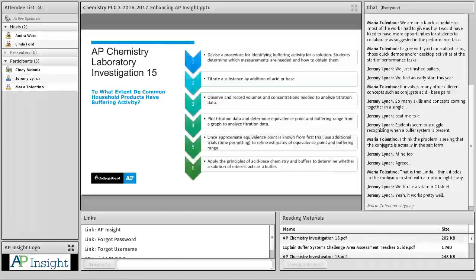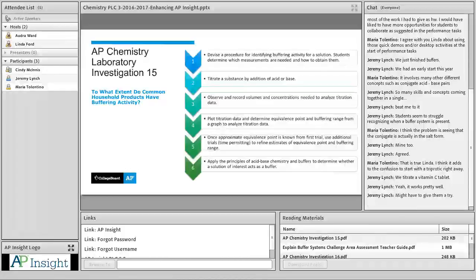Yeah, because I tell you, malonic acid and malic acid or maleic acid, they really work very well, and they give you a pretty clean graph to analyze.